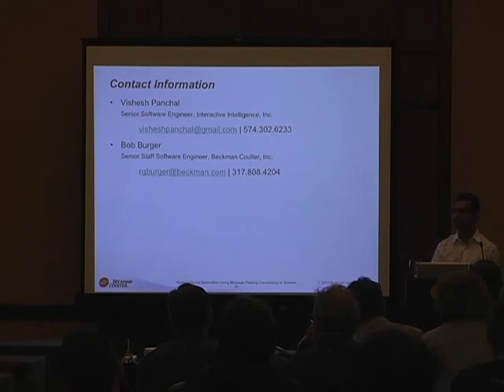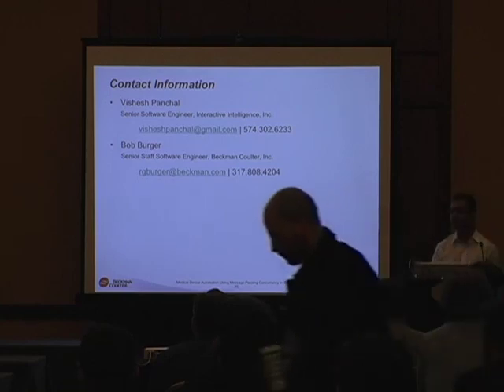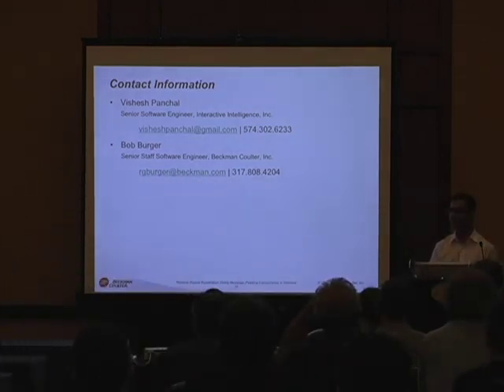FORTY would come back as a symbol, and when they try to enqueue that particular assay, they would get an error saying invalid symbol FORTY or something like that, or expected a number. So they wouldn't be able to run it. The confirm mode itself would spit out, hey, this is wrong. So they won't get through three quarters of the assay and then get an error saying, oh, by the way, we can't do this.